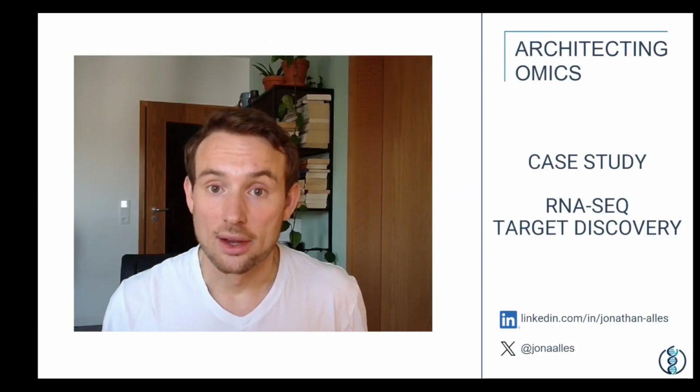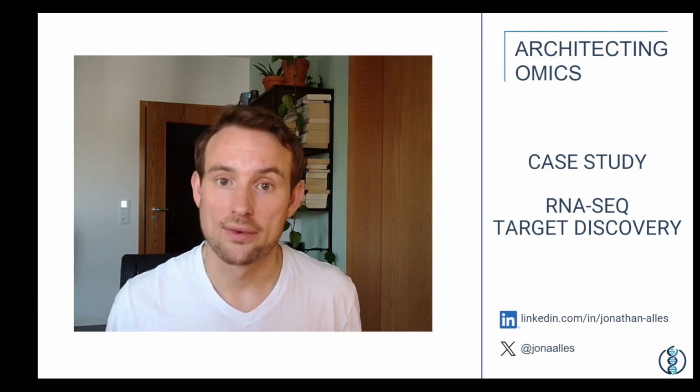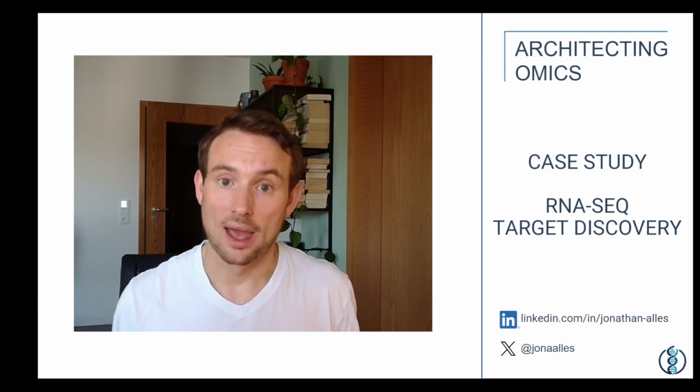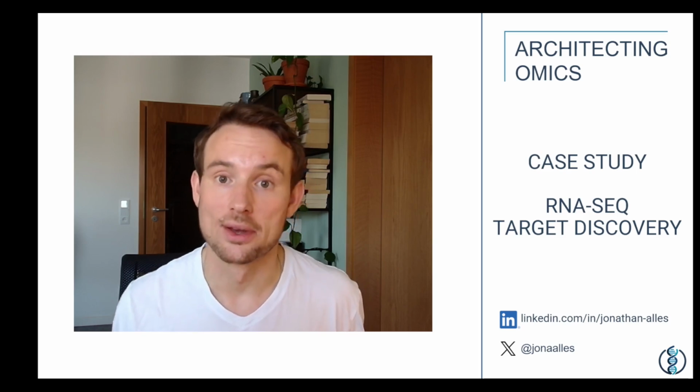So we're at the end of this case study where we looked at an RNA-Seq workflow for discovery of novel drug targets, and we saw how we can build a nice data infrastructure around such a research process.